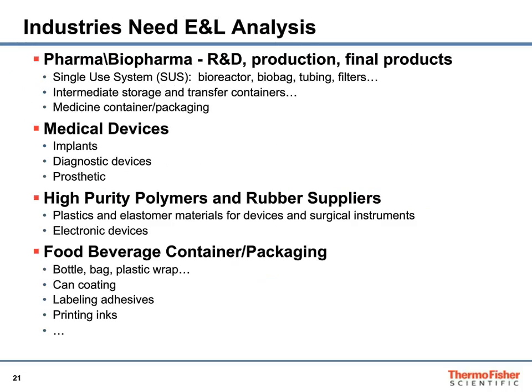So who does extractable leachable analysis? There are many industries. First of all, Pharma and Biopharma, from the starting R&D to production until the final product field, so both upstream and downstream. Especially right now, bioproduction has started using single-use systems, which makes extractable leachable analysis more important.